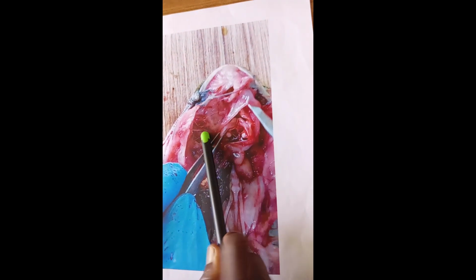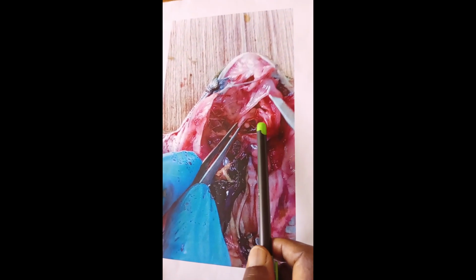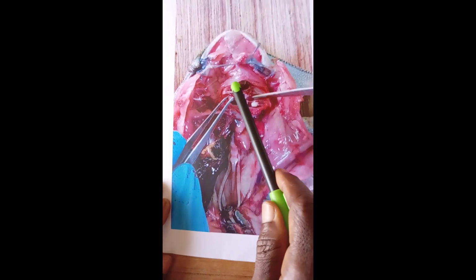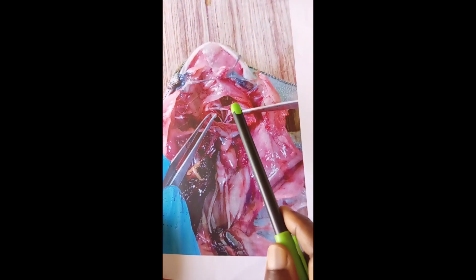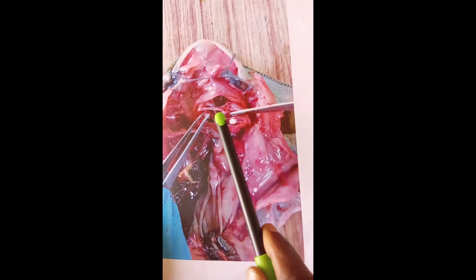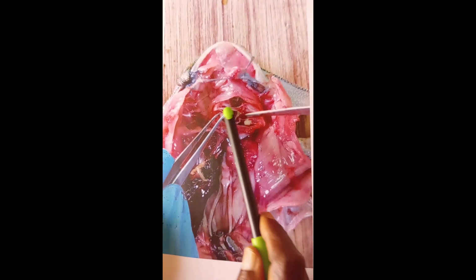When they are put to one side, one goes here, one goes here, and a hole is formed. That's the glottis. Then we have the air sacs, only in males, that enable croaking. Now here you see the arytenoid cartilage, one push, and that's the glottis being shown. These threads are fleshy elastic threads. These are the vocal cords. They are found across the laryngotracheal chamber. That's the vocal cords.